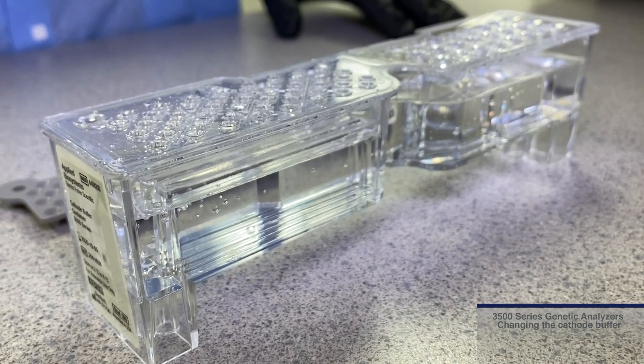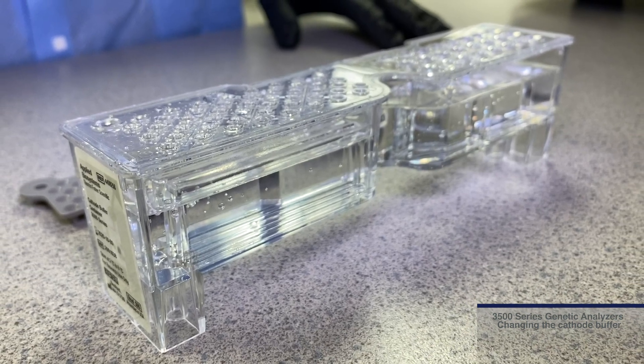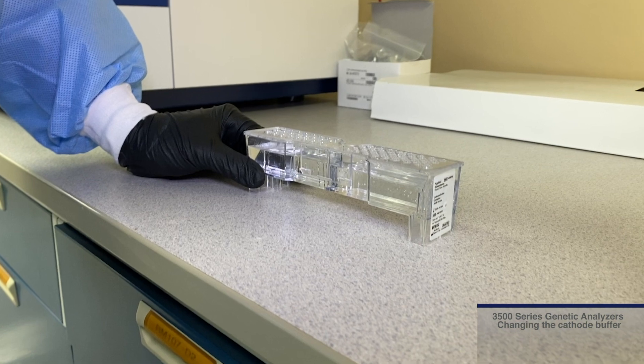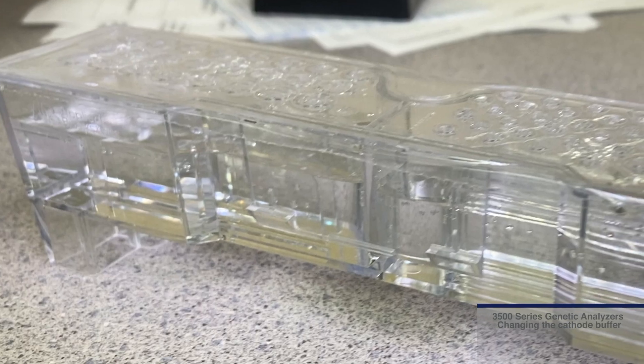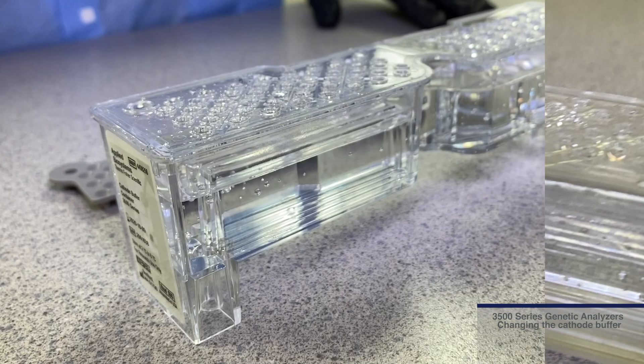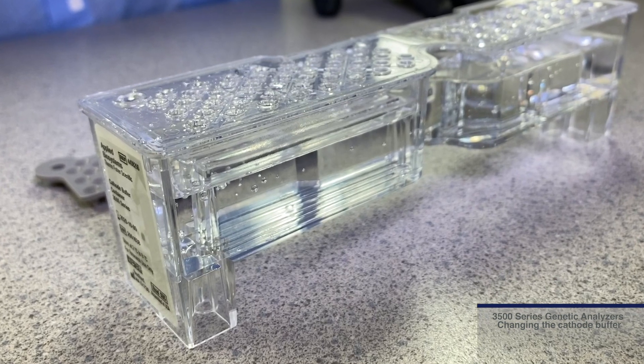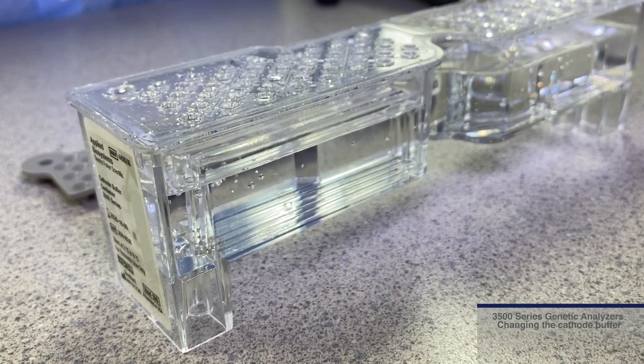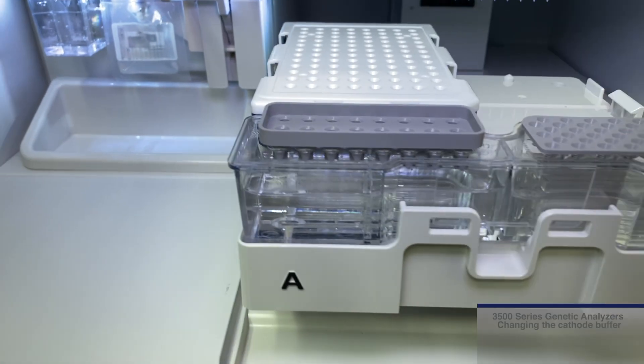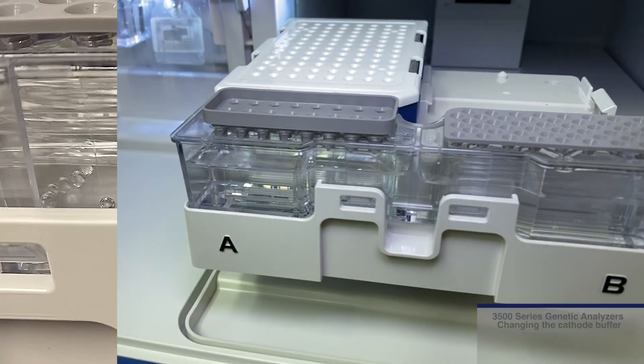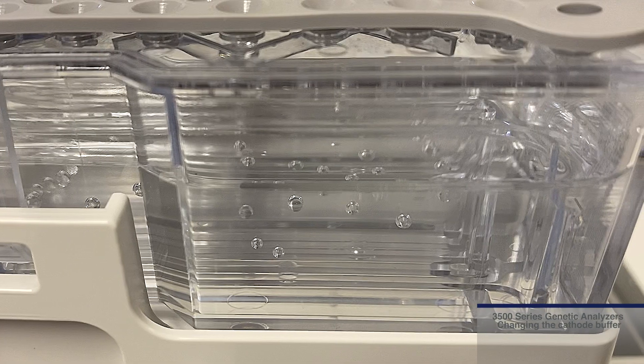The CBC container is divided into two sections. Both sides contain 1x running buffer. The left side supports electrophoresis while the right side is separated with a labyrinth design into a wash and waste section. When placed on the instrument, the labyrinth design ensures no mixing of the waste and wash sections.